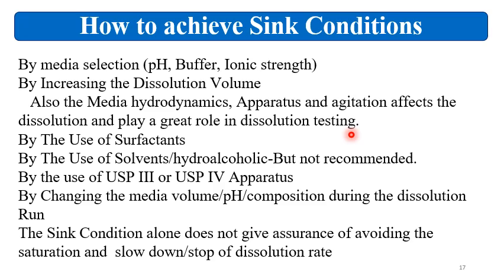Then we can use the solvents or we can use the hydroalcoholic media to have a sink condition, but it is not recommended and it is very difficult to justify, because in vivo there is no hydroalcoholic media and generally aqueous buffers are used which are in the physiological pH range. We can use the USP3 apparatus or USP4 apparatus, as these two apparatus have a more dissolution media volume.